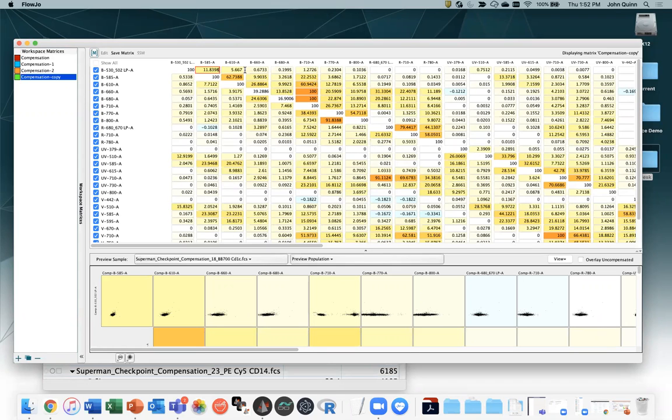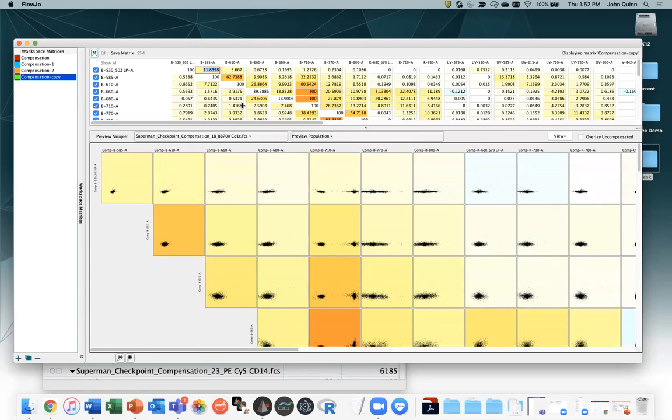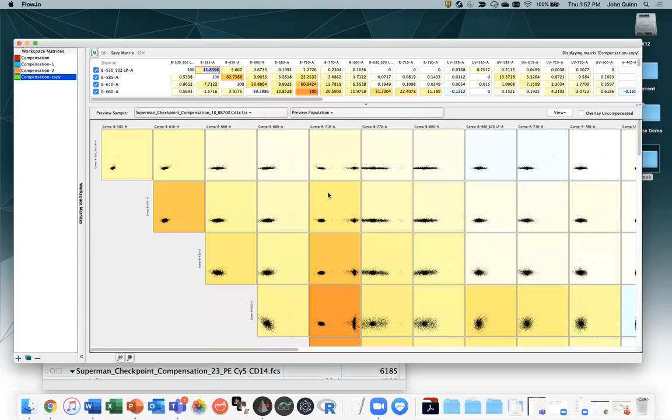So what you're doing there is telling the software that there are actually, I paraphrased, I think the message says something like, be very careful. But read that as perhaps don't do this. What you're actually doing there is saying that there is more of one color and less of another. So that is going to affect the matrix everywhere where those colors are present. And so it is very possible to make a single plot look better while making, depending on how many colors you have, many, many other plots look worse.